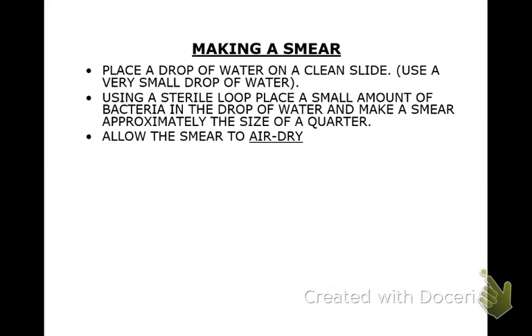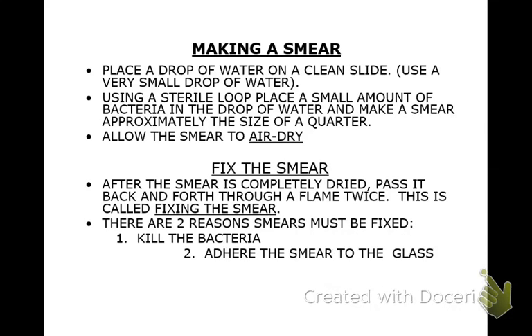Okay, so in class, when we do the Gram staining, you have to first make a smear. And you're going to take a small scoop of bacteria and put it in a drop of water. And then you're going to make a little puddle of bacteria water. And you want your puddle to be about the size of a quarter. And then it's going to air dry. Okay, I'm going to tell you in class too. The bigger your drop of water, the longer you have to wait for it to air dry. And so if you want to go home that night, which we all do, you're going to make that drop of water tiny, tiny, tiny. So that when you smear it out, it takes 10 minutes to dry, not 45.